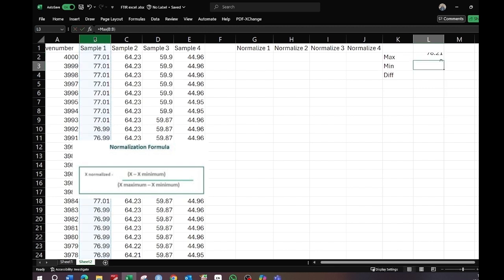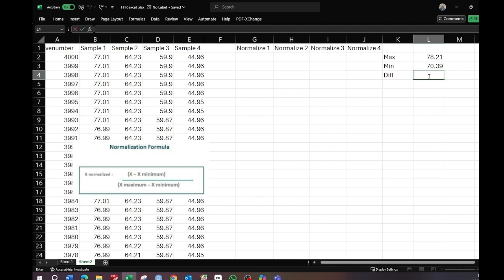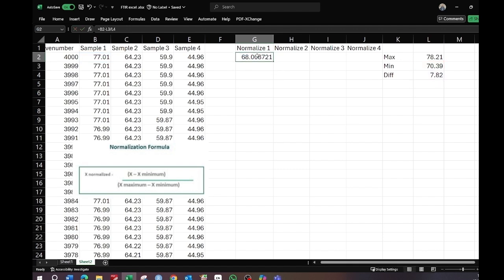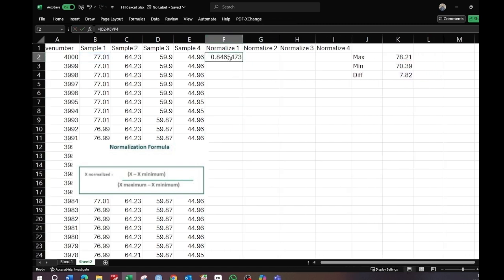Select the column, close the bracket, and press Enter. Similarly, go with the minimum — select the sample column, close the bracket. For the difference, do maximum minus minimum and it will give you the difference. Now normalize the data: select the value minus the minimum, divide it by the difference, and press Enter.